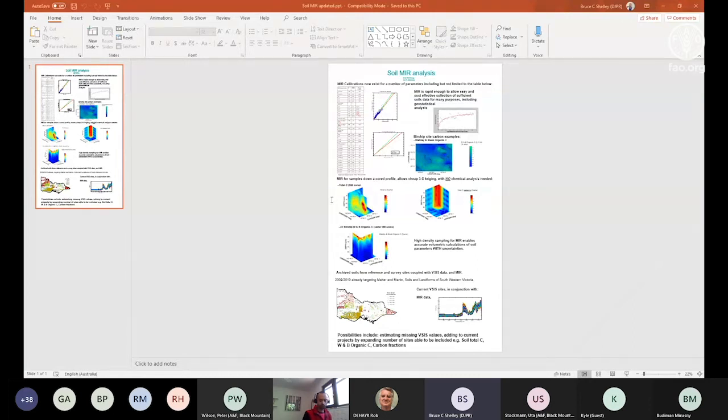We do have an auto sampler. At the moment, we hand load into a single sample holder. Part of the reason for that is we found that one person working could work almost as quickly as the perhaps somewhat archaic aftermarket or third party auto sampler that we're using. Again, for research, high throughput in short time just isn't that big an issue.